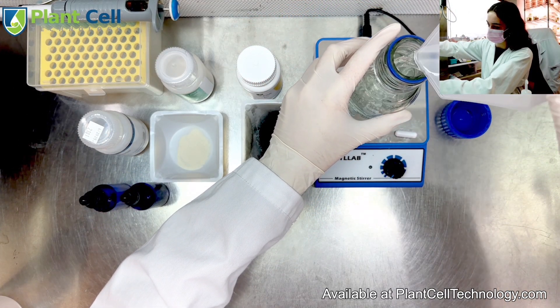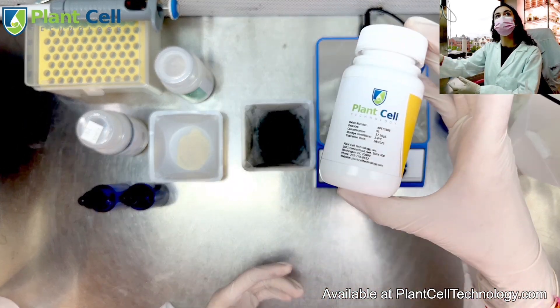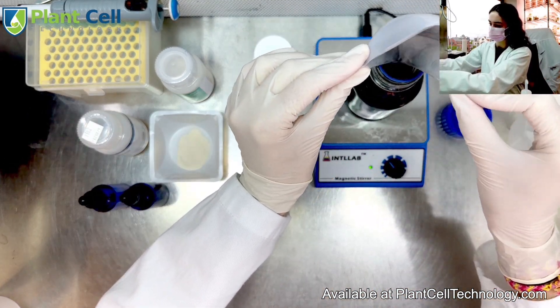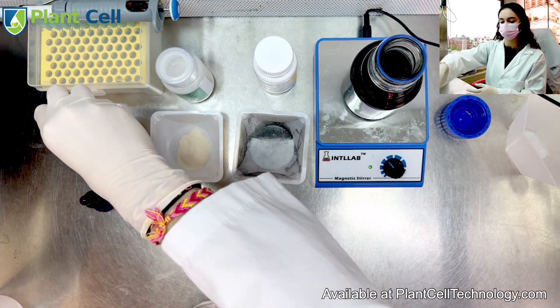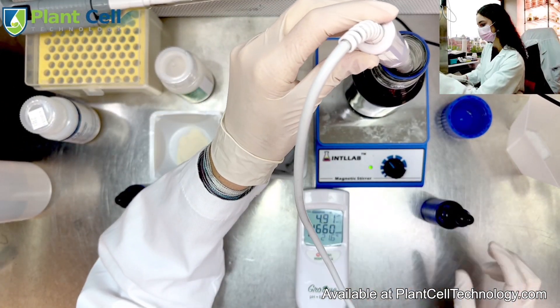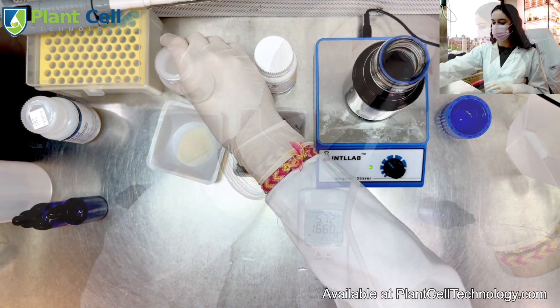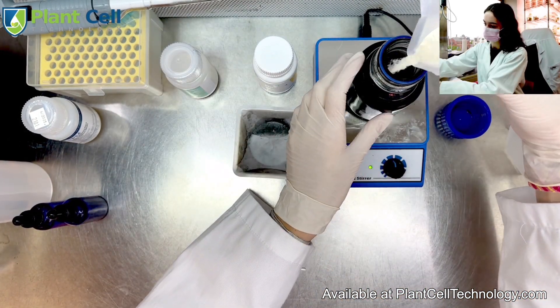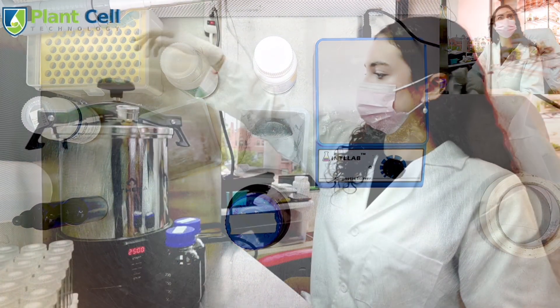You will first add 250 ml of distilled water and use a stir bar to agitate the solution in the media container. Next, you will add 6.84 grams of orchid media. I added 250 microliters of PPM to the mixture. After, I calibrated the pH so that it reached 5.8. The last step is to add 2 grams of agar to the solution. I did this process twice for 2 media containers so that it could fill all 21 test tubes. Make sure to add autoclave tape on your media containers when you are finished.